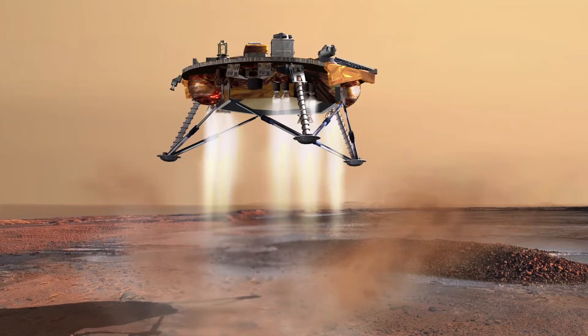Thirty years of experience and research lives inside this simple beige box, including experience gained working with NASA to design and build this thermal property sensor that landed on Mars in 2008.